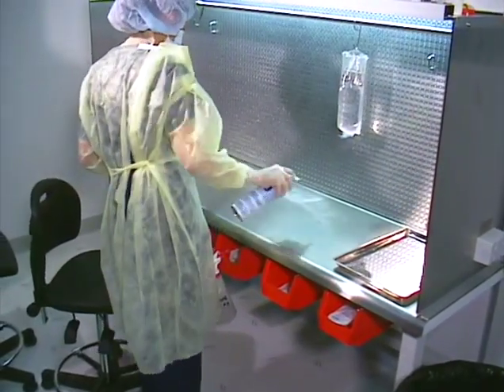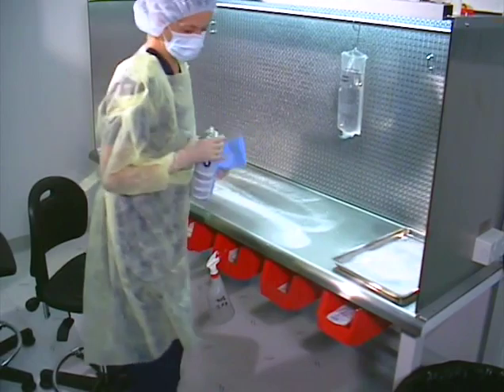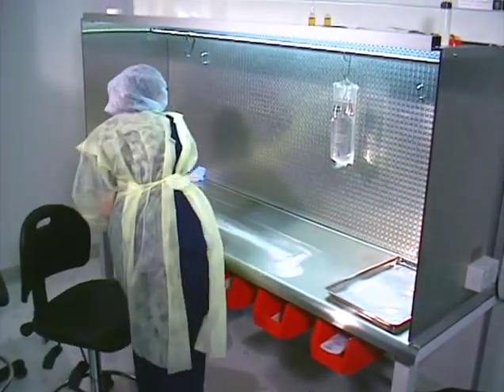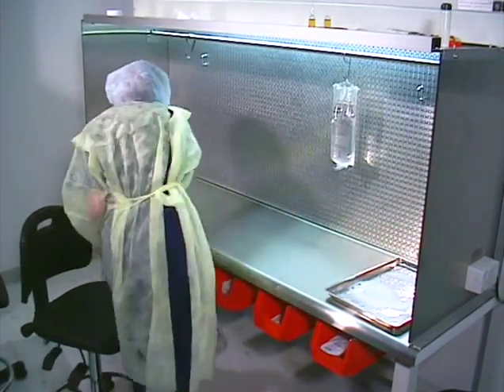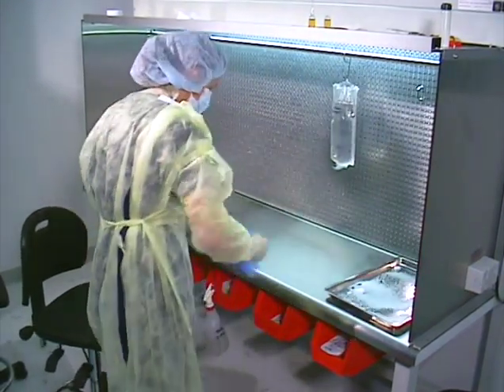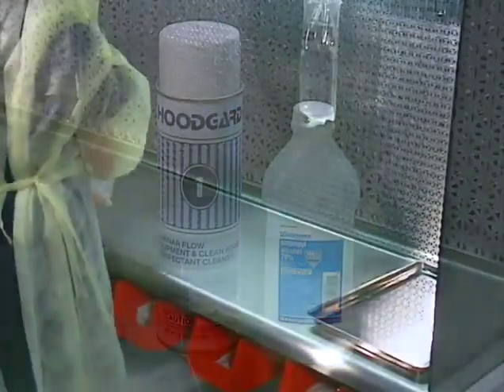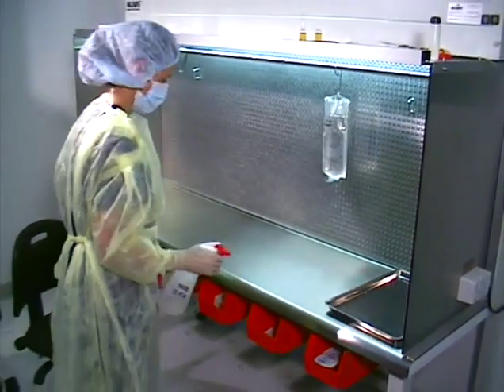Regardless of how the hoods appear, they must be cleaned and disinfected prior to each use. Many drug residues are not alcohol soluble. Neither does alcohol alone provide a complete spectrum of antimicrobial action. Therefore, a high pH, low residuing water-based disinfectant cleaner should be used prior to disinfecting with 70% isopropyl alcohol to both clean and disinfect the critical work surfaces.